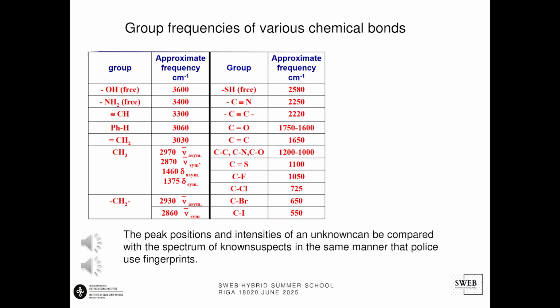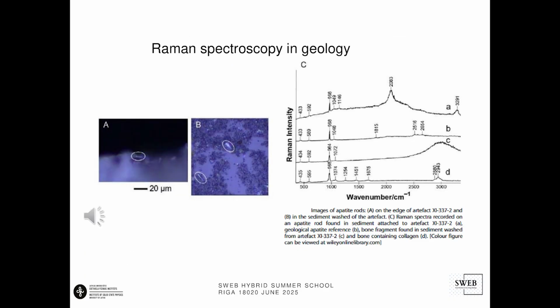The use of the group frequency method in the analysis of Raman spectra is widespread. Group frequencies are vibrations that are associated with a certain functional group. It is possible to identify a functional group of a molecule by comparing its vibration frequency on the Raman spectrum to a Raman stored data bank. Raman spectroscopy is increasingly used in many specific studies, like in geology.